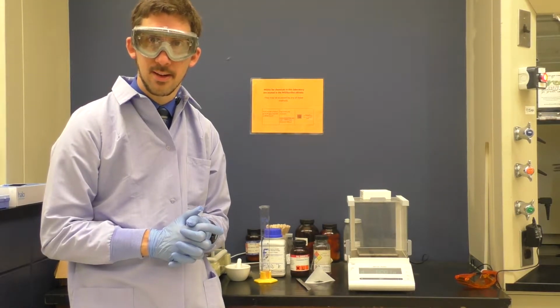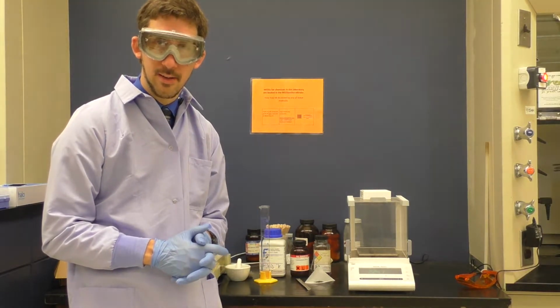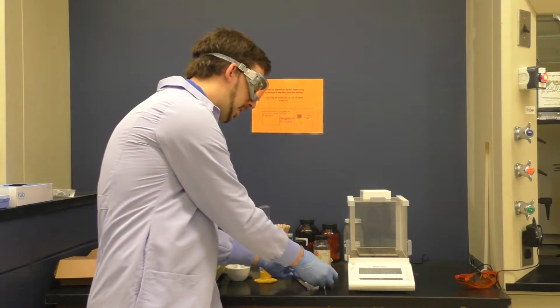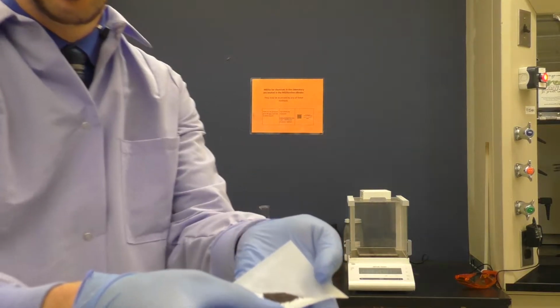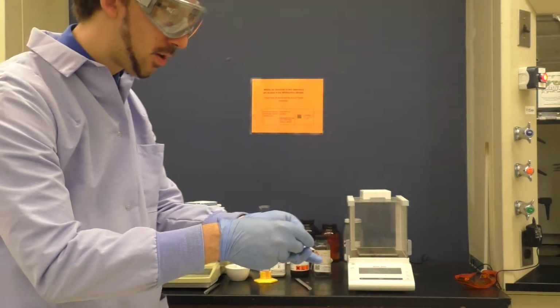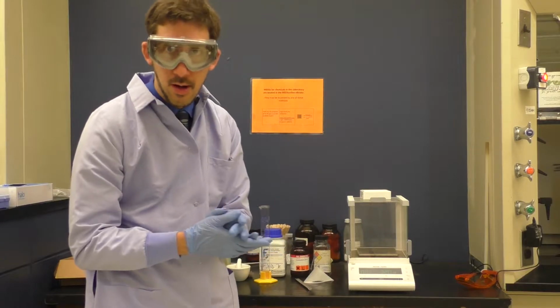Most of them are white solids unless they are highly conjugated, which this is not. It's not a nice white solid. It doesn't look at all like something we would want to ingest. In fact, I've weighed out a little bit of it, and I'll show you real quickly. It looks just like charcoal. It's black. Not something you're going to want to ingest, and certainly we wouldn't want our final product to be that black color.